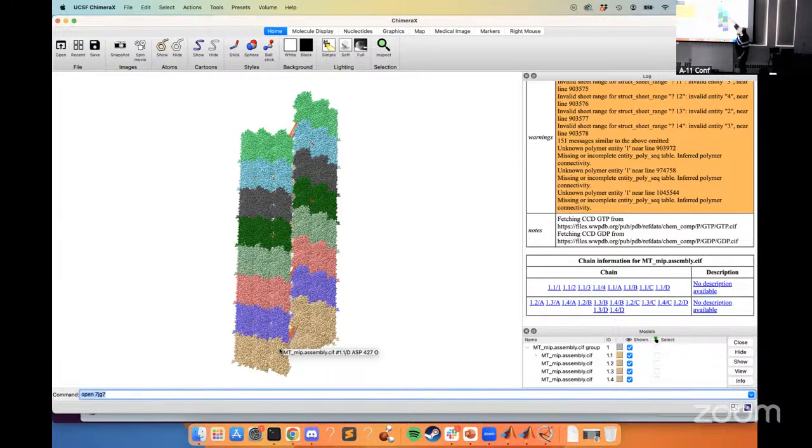It got repeated multiple times. I don't know how long that is, to be honest, but if I had to guess, it's probably between 50 and 100 nanometers. But there's no reason why we used only that. It just turned out that it didn't seem like we needed anything longer, and so we haven't made anything longer.